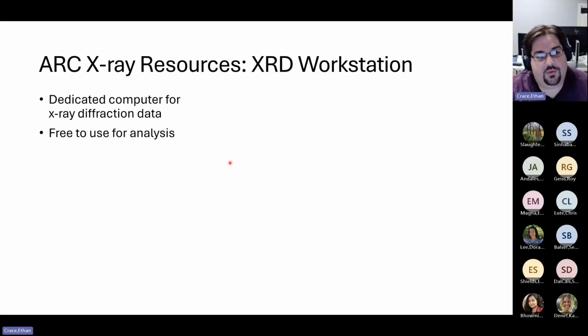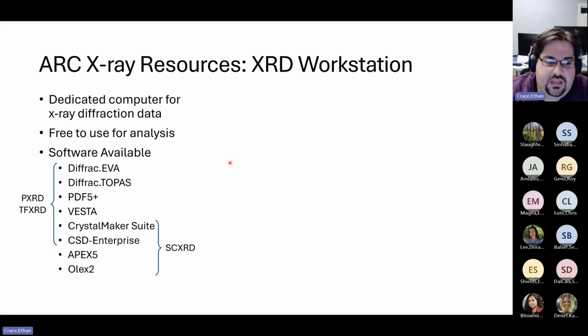The last thing that I'm going to talk about, I suppose we can consider this an instrument, is the XRD workstation. This is a dedicated computer that is in the ARC that is meant for working up and examining your X-ray diffraction data so that you don't have to sit at the instrument computer to do any workup. This is free to use for anybody. You just have to come talk to me. I'll show you where it is and how to log in, and you can start working with that system.